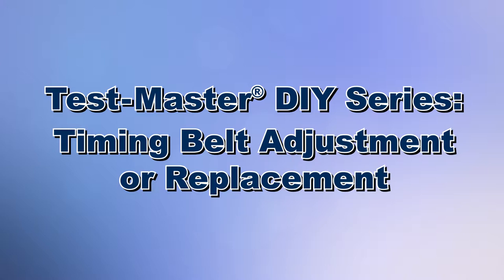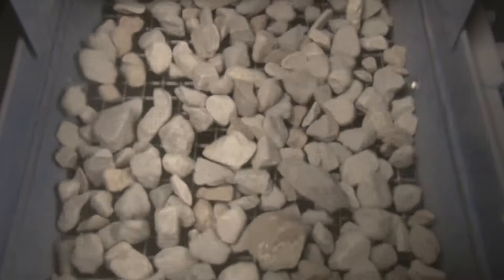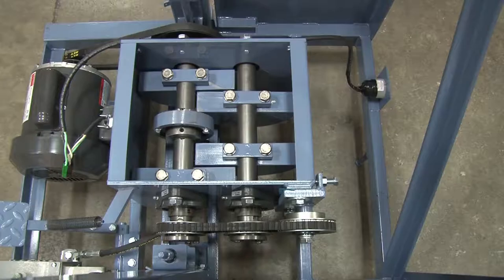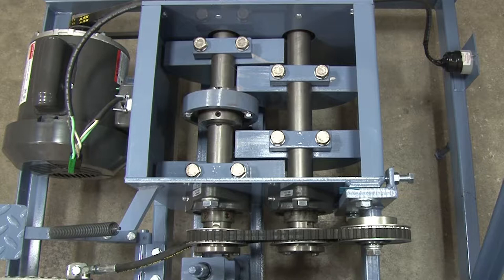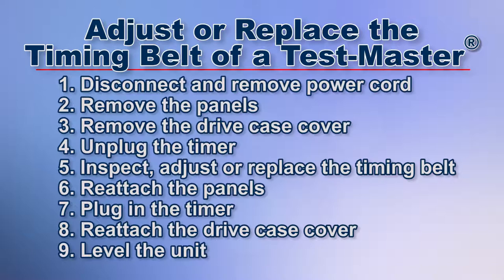Today we're going to demonstrate how to adjust or replace the timing belt of a TestMaster testing screen. The Gilson TestMaster testing screen delivers accurate particle size separations on large samples, and the internal rotating counterweights of the TestMaster drive system equalize the vertical screening action for smooth operation. Here are the steps to adjust or replace the timing belt of a TestMaster.